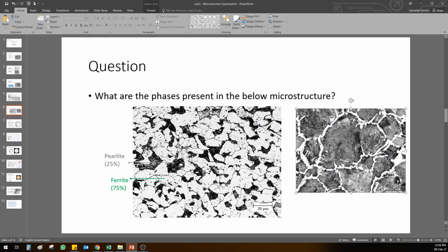When you have cementite, it will always or sometimes always come with perlite. Okay, remember. And also cementite is a little bit thicker line as compared to grain boundaries. If you can see here, the black grain boundaries are very thin and almost like a line. But cementite is like a broken thick passage here, if you can see this. So this is how you recognize whether there is cementite inside or not. Okay, so cementite is looking like this.